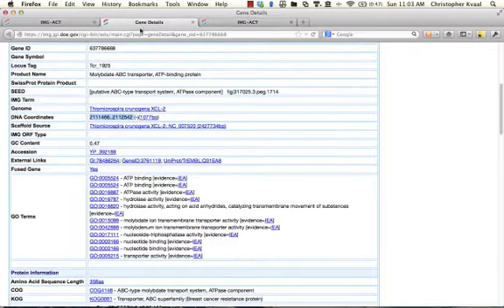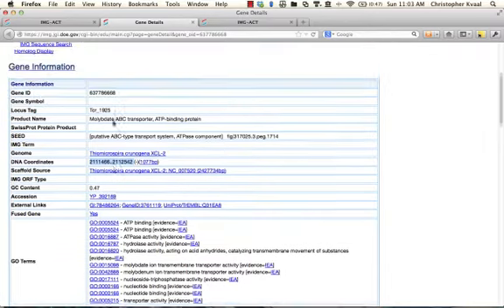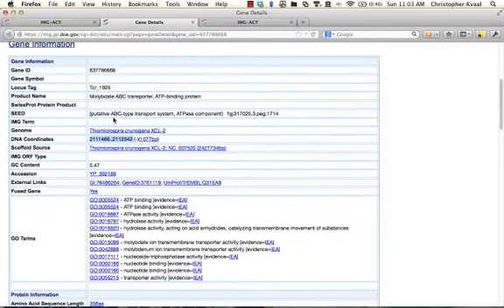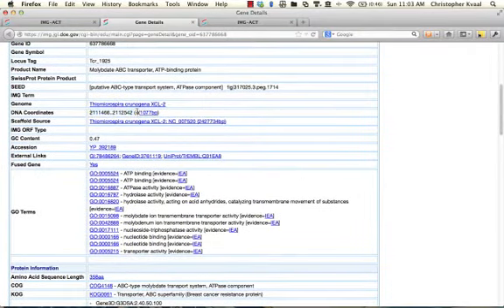So that sort of as a learning moment right here, you recognize that that's a very large number, 2,100,000 11,466. Yeah, so if you're wondering why and how that number got so big, we'll come back to that in a minute. Another key point is the minus sign, the recognition that double-stranded DNA has 6 different reading frames, 3 in a positive direction and 3 in a negative direction.